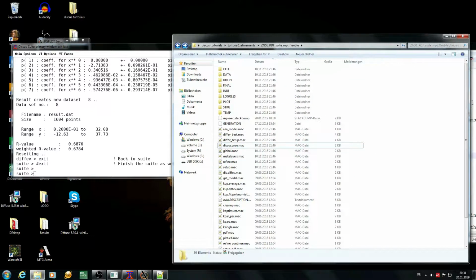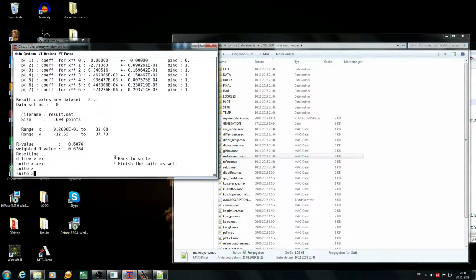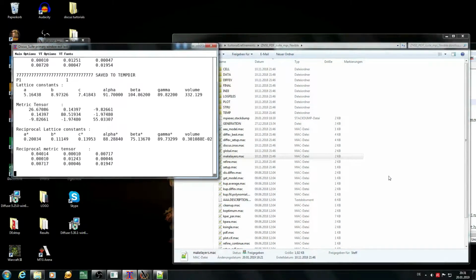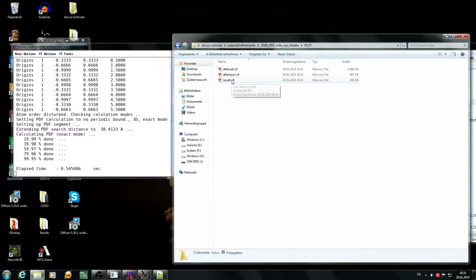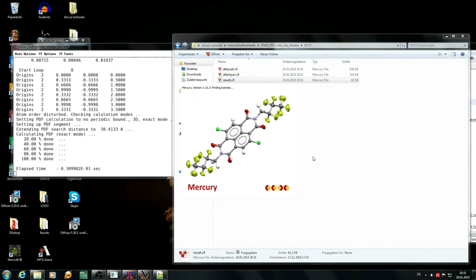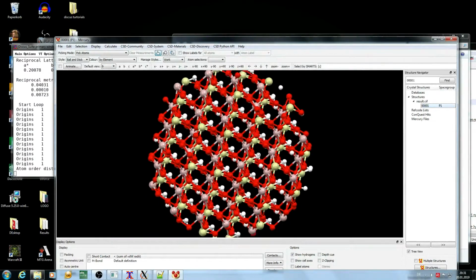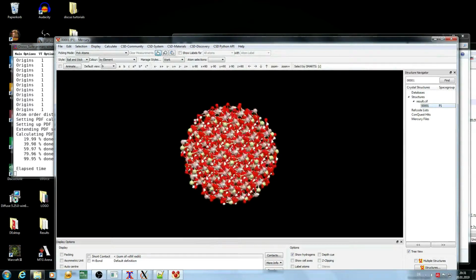Okay, having done that and having saved that, you can now rerun the refine macro with the second structure and another data set. So if you do that, everything should work. When we look into the plot macro, so again the result.cif file, if you just want to open it with any program, you see that the structure has changed. So from zinc selenide we switched to kaolinite.